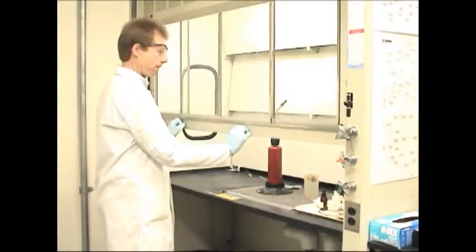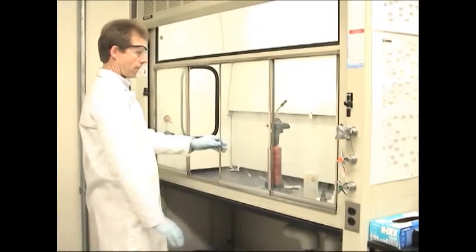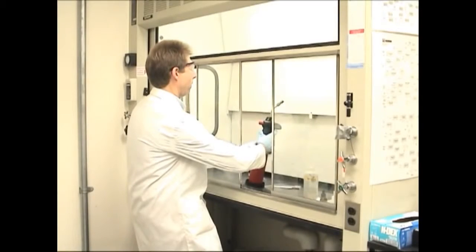Some hoods have a combination sash that can be opened horizontally or vertically. In this case, the sash is lowered, then a horizontal sash is adjusted to provide protection from explosive reactions or chemical splashes.